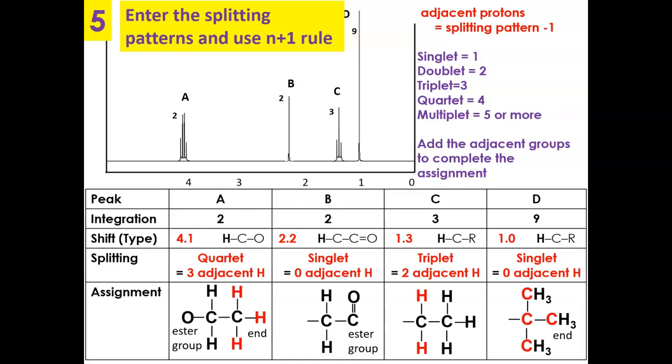So what I've done in red there is I've drawn on the CH3 group, which is adjacent to our group in question. There are 2 H's on a carbon single bond. Well, what that's done is it's created a terminal for our molecule. We know on the alcohol side what the end must be. And of course, that's the OCH2CH3 group.